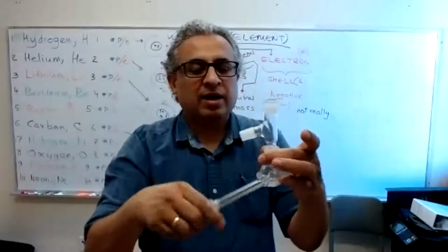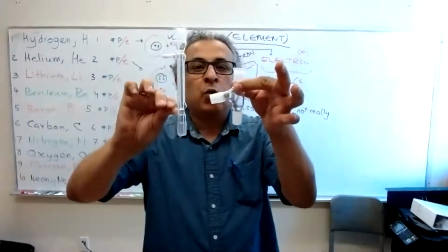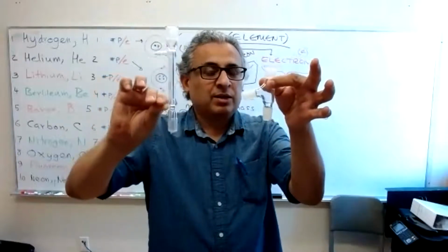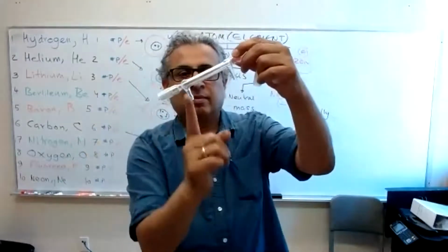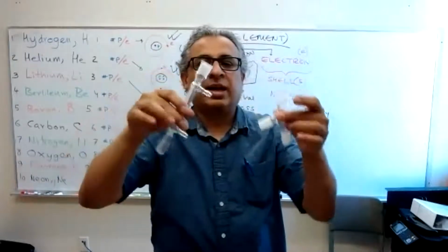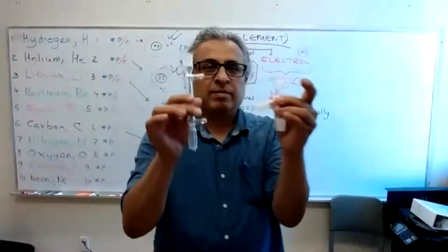This guy, I'm going to hold them in my hand. Which one looks like it can condense? Which one can be cooled using some technique? The one on your left, the tall guy or the short guy? Which one can use a technology to make things cold inside? This one or this one? Which one looks like a condenser? Left or right? The left.